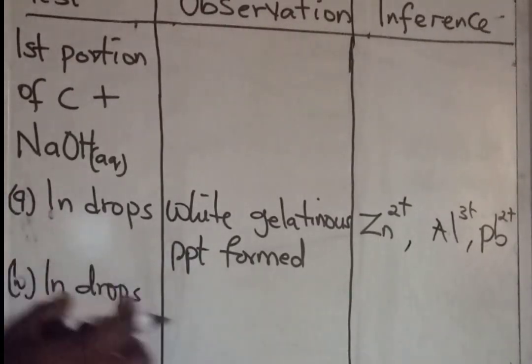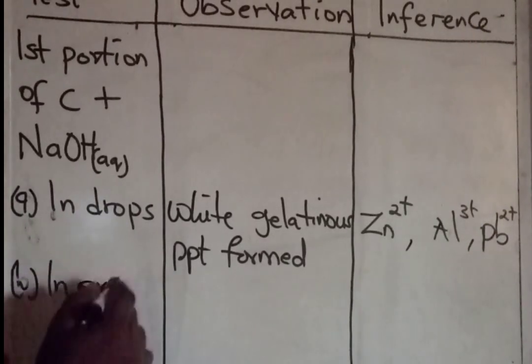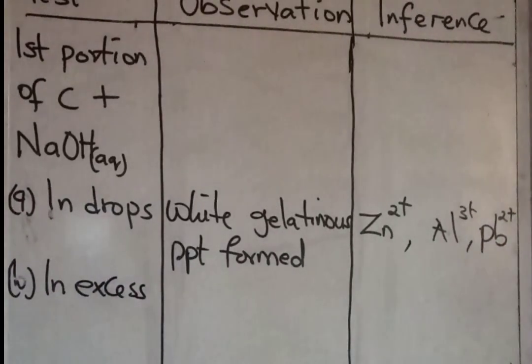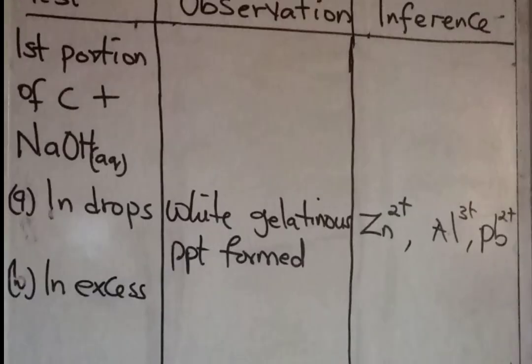Now, when you add sodium hydroxide in excess (sorry, I wrote "in drops" twice; it's supposed to be in excess), we want to know if the precipitate that was formed in step 1 will dissolve or not.